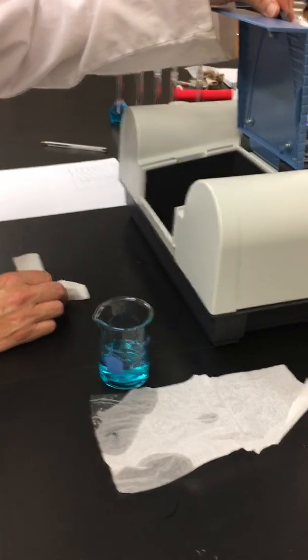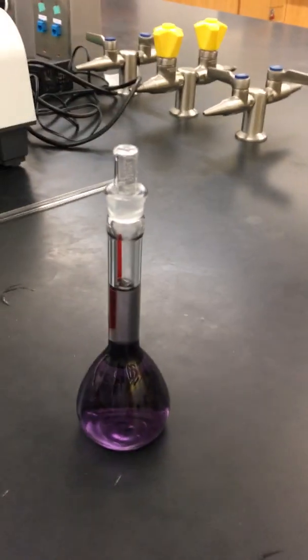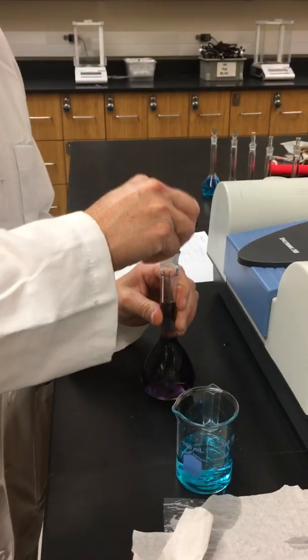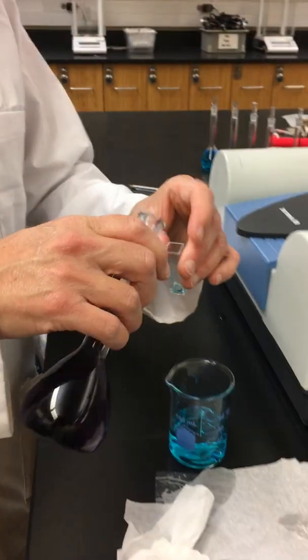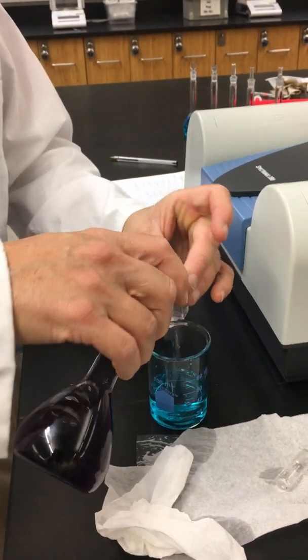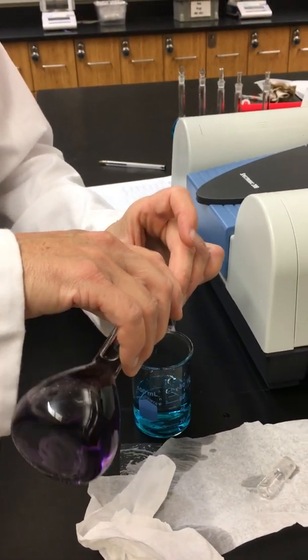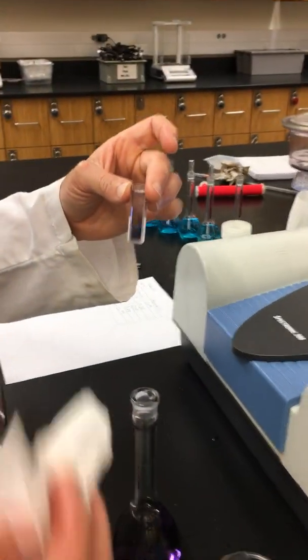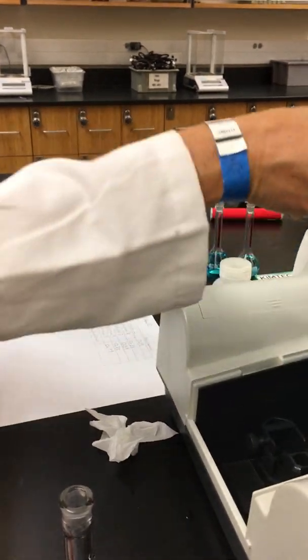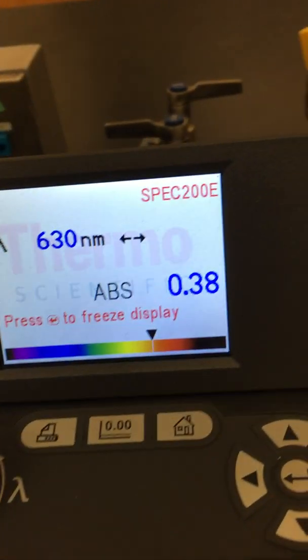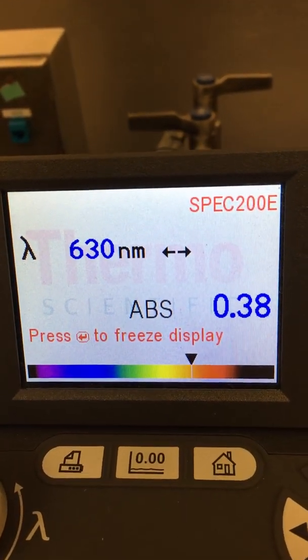The last one that we are going to measure is now our Kool-Aid mixture that we made in part A. Remember, we're trying to determine how much FD&C blue dye number one is found inside of our solution. First thing we want to rinse away anything we had from our previous one. Now we're ready to make that final measurement of our absorption of our Kool-Aid mixture. Our absorbance is 0.38.